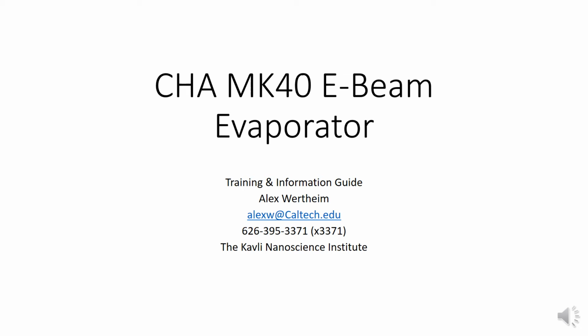Hello, and welcome to the CHA E-beam Evaporator Training and Information Guide. This presentation is meant to give you an introductory overview of operating the evaporator so that you might minimize the amount of necessary in-person training time.